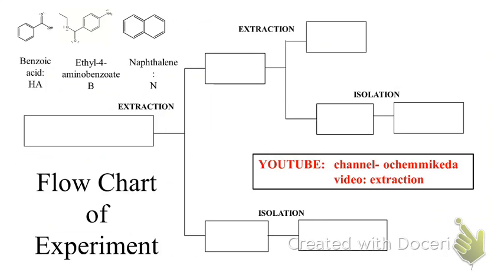To start off with, we've got a key in the upper left-hand corner to describe all our individual structures that you're going to be dealing with for this lab. Because drawing those structures out is going to be a bit tedious, I came up with abbreviations. We're going to start off with a mixture of HA, B, and N, all in one container.